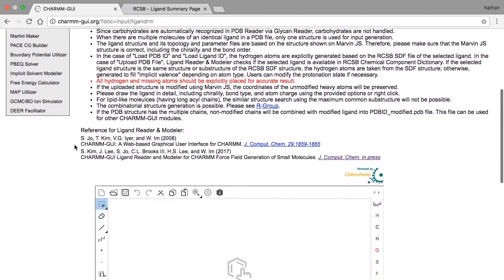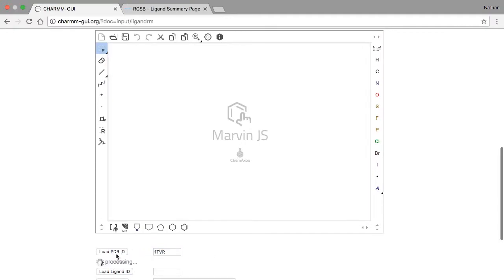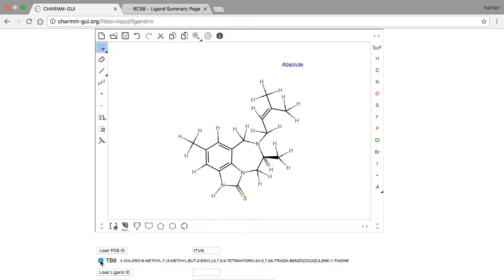To get started, load in the PDBID 1TVR. 1TVR is an HIV reverse transcriptase enzyme in complex with an inhibitor. When the PDB structure loads, click on TB9 to show the reverse transcriptase inhibitor.